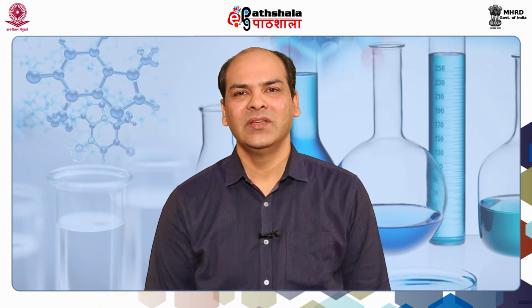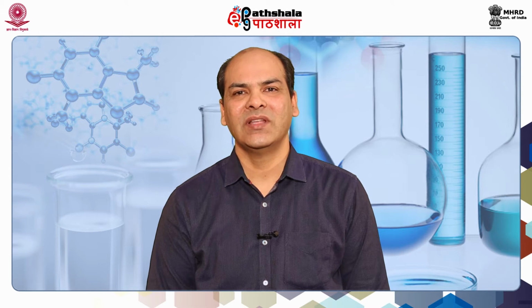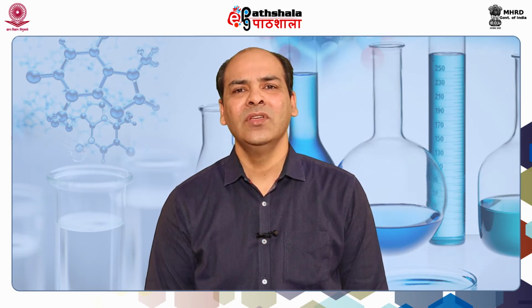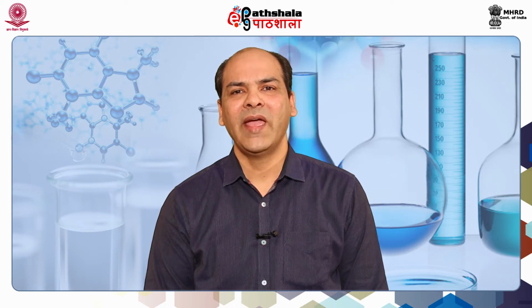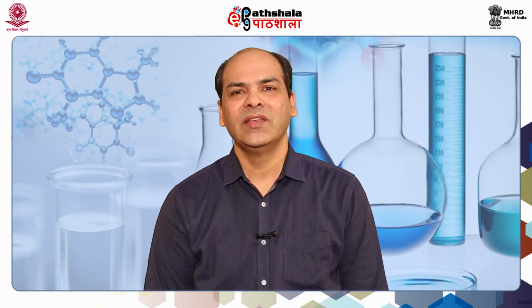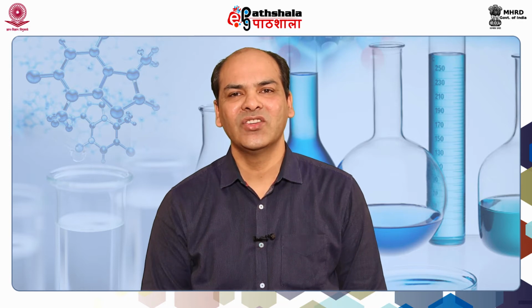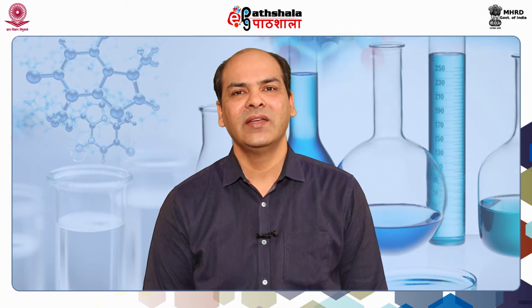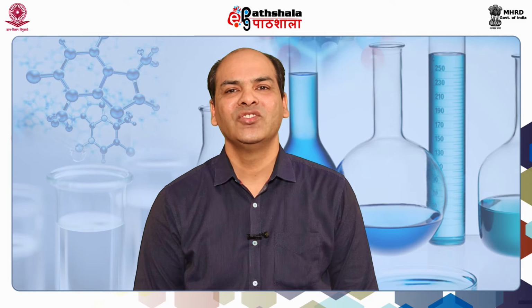Today I will be talking about two related techniques, circular dichroism and optical rotatory dispersion. They are very closely related techniques, and they are very powerful for determining the structure of small molecules as well as macromolecules like DNA and proteins. This technique evolved long back, and with the advancement in instrumentation, today we can use it to calculate the secondary structure of proteins, protein-DNA interactions, and structures of DNA like A form, B form as well as Z form.